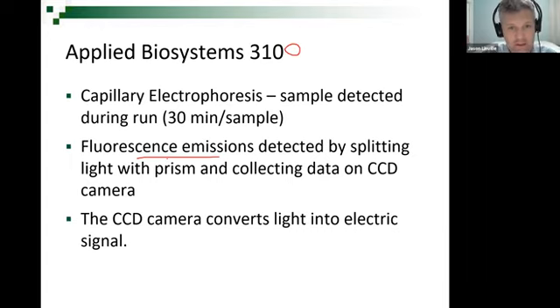So when we say we're racing the DNA through the capillary, we had the image of David Caruso at the finish line, and we replaced him with a camera at the finish line, the waiting line. So what happens in that detector window, as the DNA starts traveling through the capillary, the laser hits the detection window. And when the laser hits the detection window, no DNA has reached it yet, so basically the camera sees nothing. The laser's hitting the detection window. Sorry, I'm dying here live on camera. And nothing's happening.